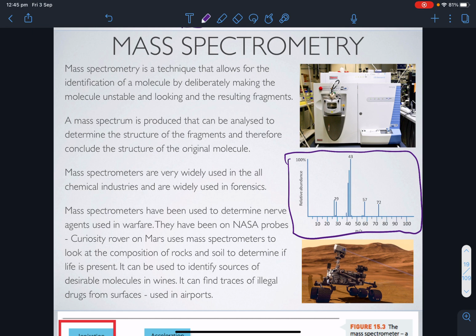So small suitcase size ones of these. This one here is a typical one that you see in a lab, and it's hard to get a perspective on that, but that's about 1/2 meter tall by about 3/4 of a meter long, and it's about 1/2 meter deep. Kind of decent box size. Okay, so you can get smaller ones. They're more expensive, of course, but not quite as adaptable.